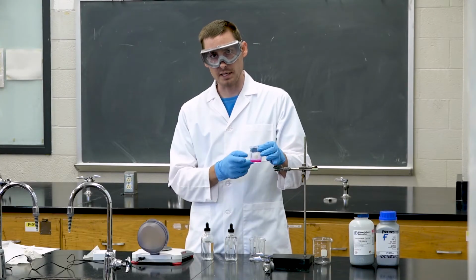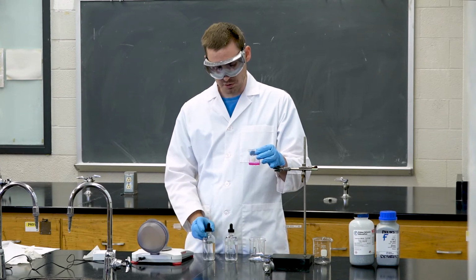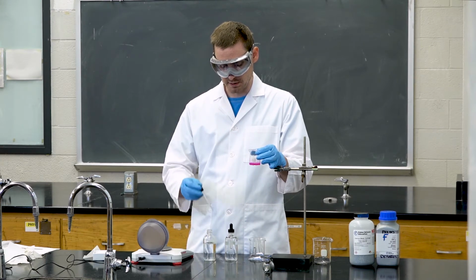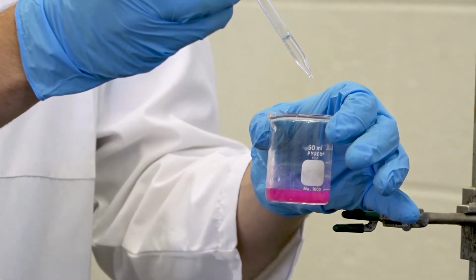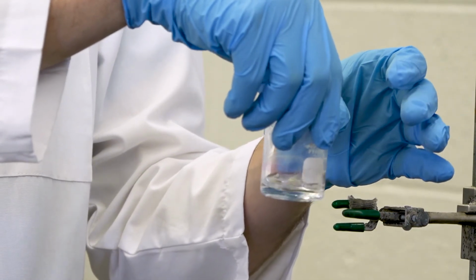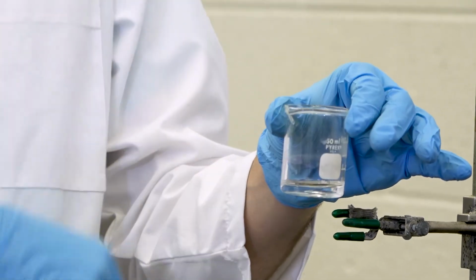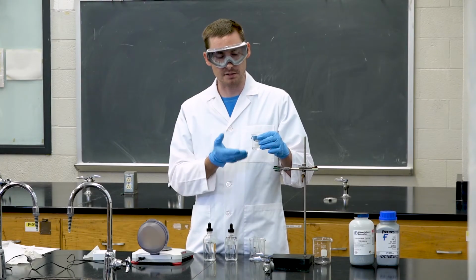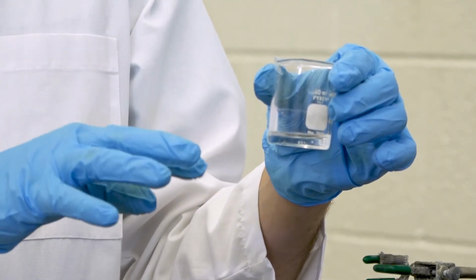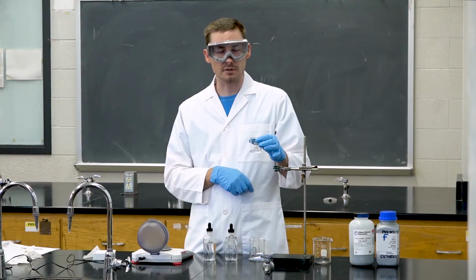Phenolphthalein indicator is pink when it's in basic solutions, but it's colorless when it's in acidic solutions. So slowly we're going to add drops of 6 molar hydrochloric acid until colorless. After we have added the 6 molar hydrochloric acid and the solution is now acidic, you will notice that it is clear in color, which means that the phenolphthalein indicator is in an acidic environment. That concludes this part of the experiment.